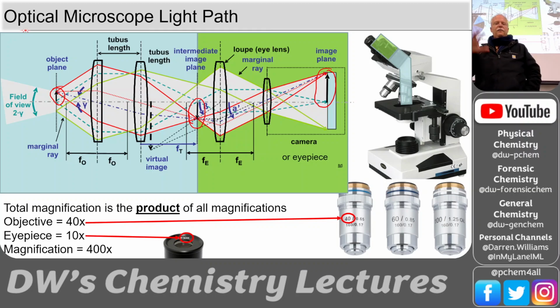And so the total magnification of this is the product. These numbers are multiplied by each other. So if you have an objective lens here, this one says a 40 on there, so it's a 40x objective. Here's a 60x and here's a 100x. There's not much difference in their dimensions, but you can look at the lenses, and they look quite a bit different. Okay, so 40, 60, 100.